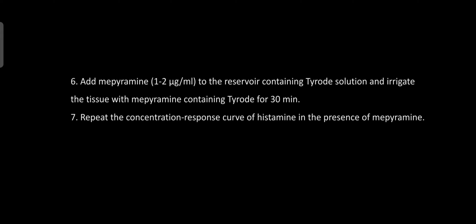So that is concluded further by conducting the experiment. After that, repeat the concentration response curve of histamine in the presence of mepyramine to find out the antagonist property of mepyramine against histamine on the H1 receptor.